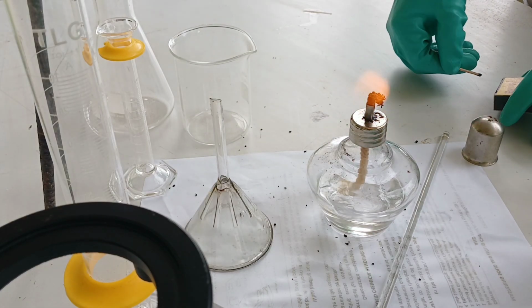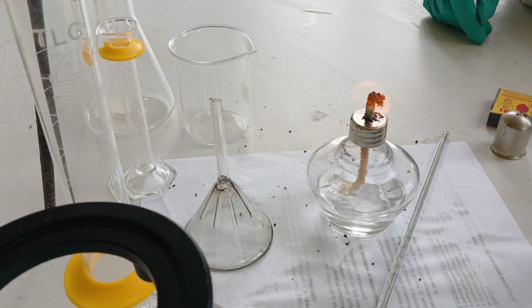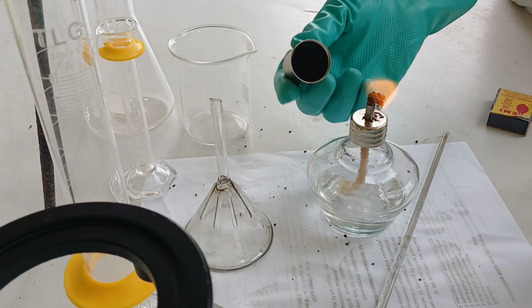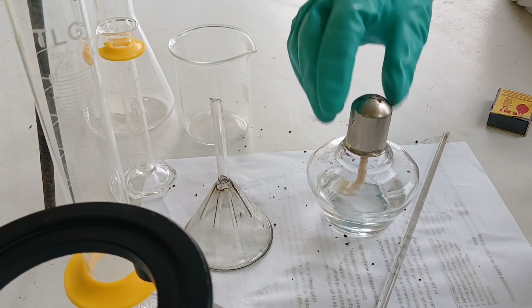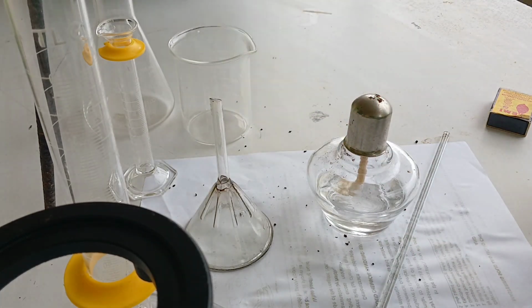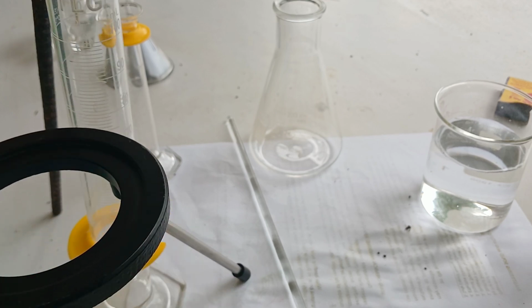So just like that, you will be using this later, the alcohol lamp. That is for checking only how to kill the flame. Just put the lid directly onto the alcohol lamp to kill the fire. Do not blow using your mouth, it could cause a backfire. So that's the best technique to kill the flame.